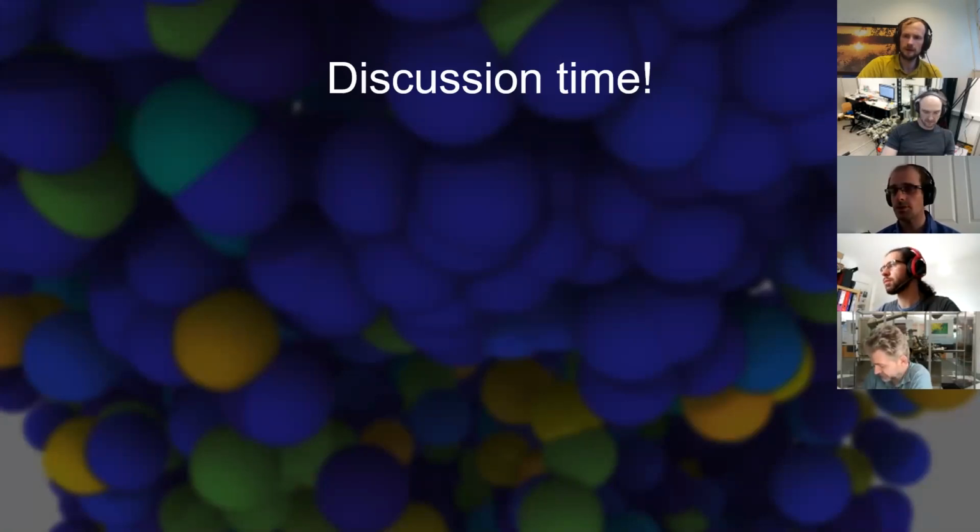There is other functionality within that software, things like mesh processing, spectral analysis, working out background counts, doing things like ion identification, where it's not focused on POS files. So I think it's quite a horizontal library in terms of covering lots of different things, but it's very needs driven. So you might find that it doesn't necessarily capture your need, but we'd definitely like to hear about what your need is and what we could incorporate there.